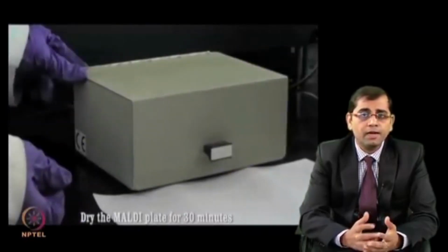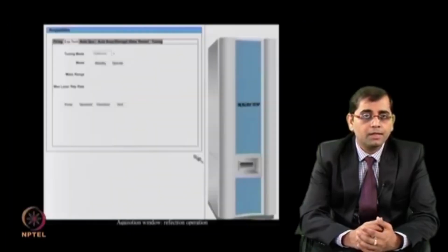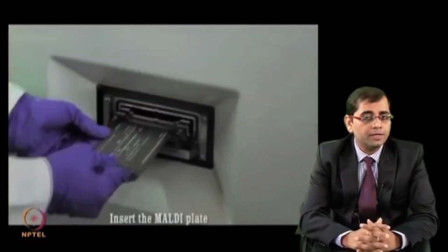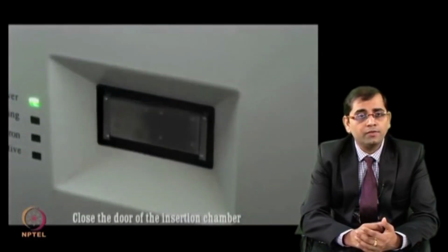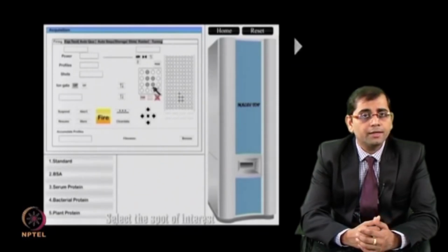It offers several advantages such as quick purification, sample enrichment, and ensures that there is no contamination. However, it can purify only a limited volume of the sample and also absorbs some amount of protein sample, thereby leading to losses.